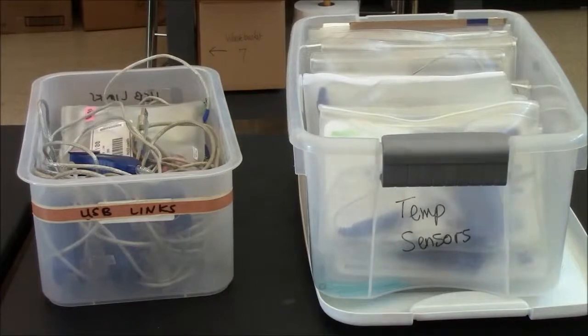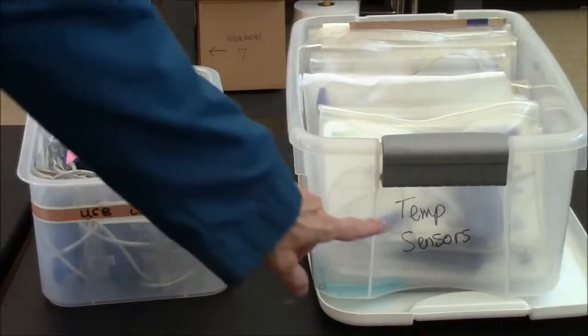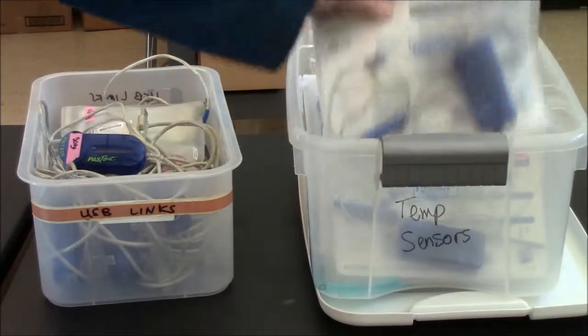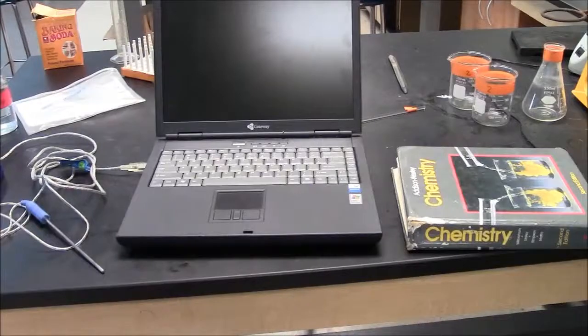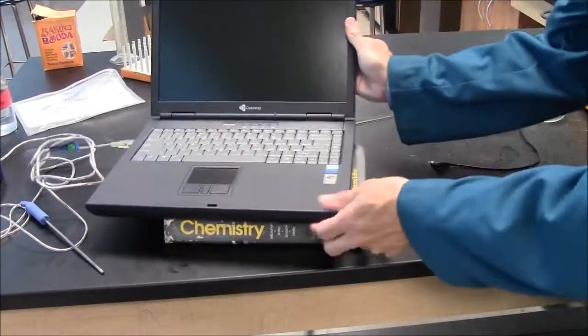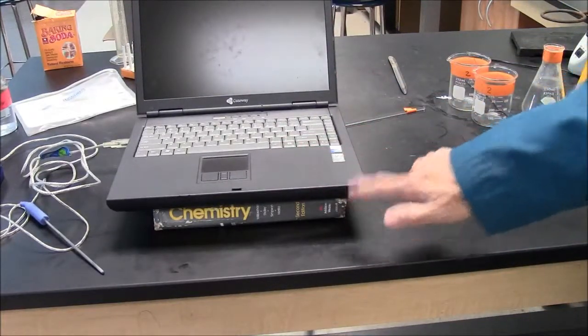There are two boxes on the buffet table, one for USB links, which look like this, and one for temperature sensors, which looks completely different. Get one of each. I've given you an old chemistry book. Its purpose is to act as a platform. In case you spill the chemicals, this will keep the computer dry.